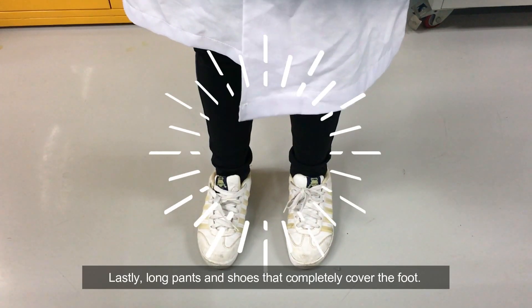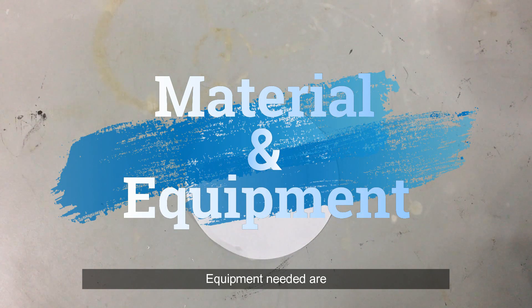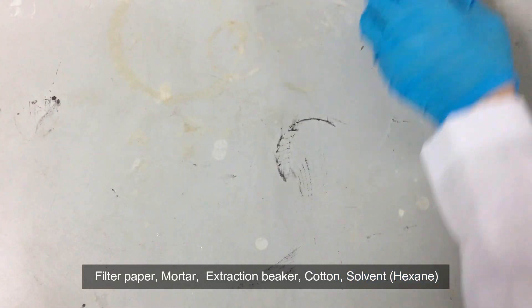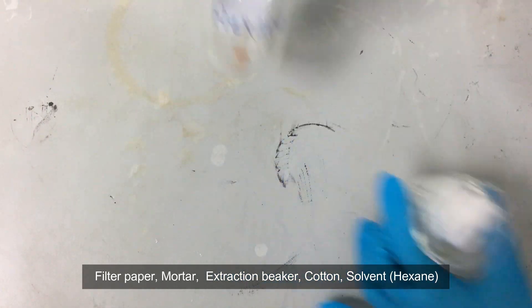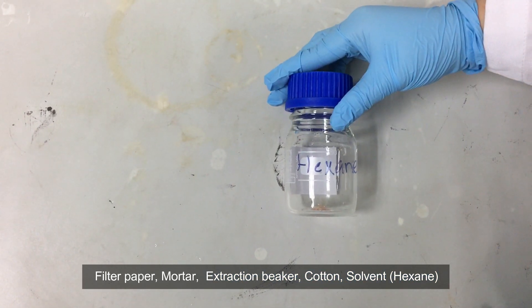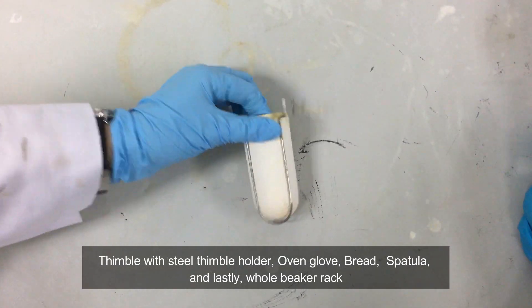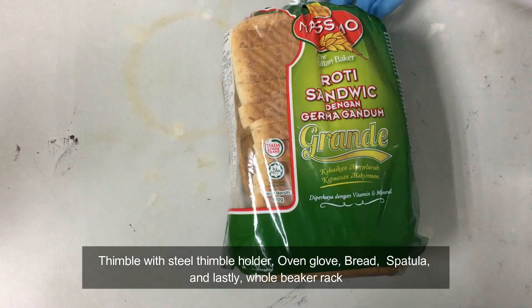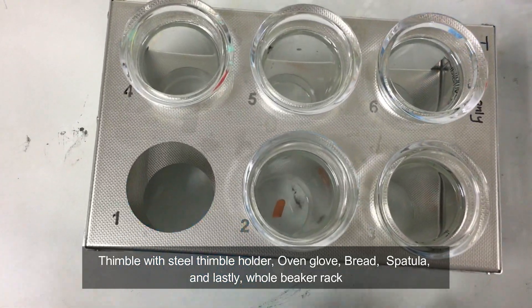Lastly, long pants and shoes that completely cover the foot. Equipment needed are filter paper, mortar, extraction beaker, cotton, solvent which is hexane, thimble with steel thimble holder, oven glove, our sample which is bread, spatula, and lastly the whole beaker rack.